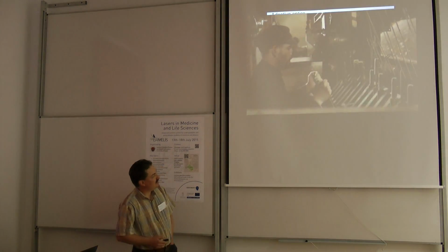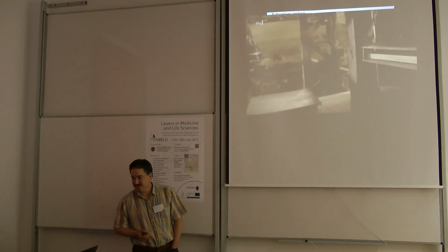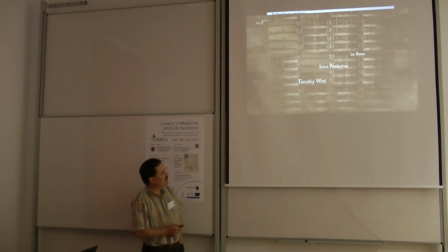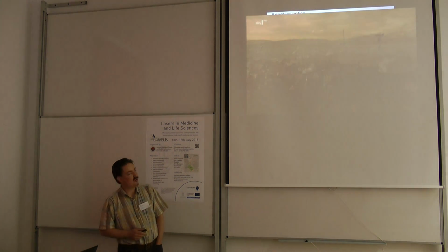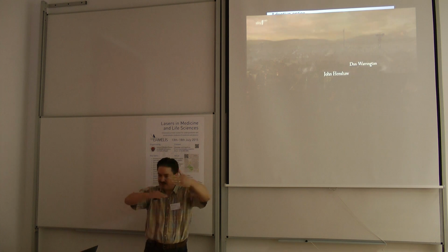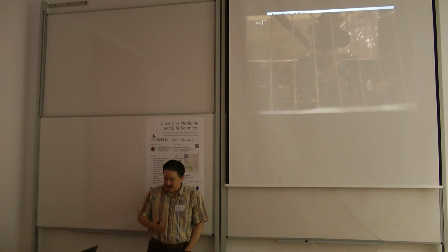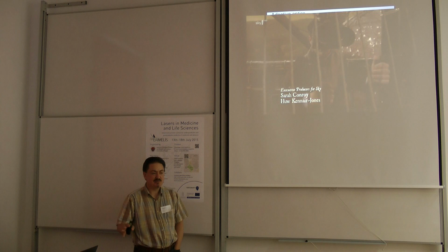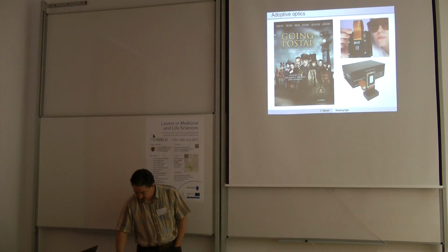So if you like fantasy, this is from a book by Terry Pratchett, who died of Alzheimer's some months ago, unfortunately, so there won't be any other books. Well, the citizens of this world use these huge semaphores, which are like binary displays of segments that you can independently turn on or off. And the citizens of this world use them to communicate. And I'm using exactly the same idea for correcting the aberrations. I'll try to explain how it works.